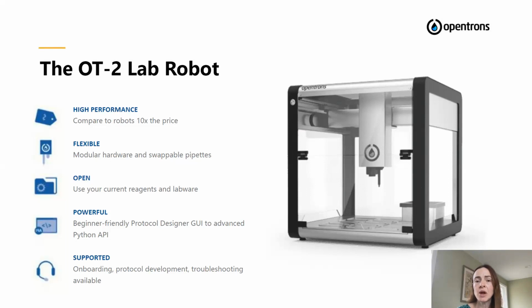One of the things that prevent people from getting into lab automation is the high upfront cost, and then also, as Carlos mentioned, the fear, right? So that's something that I think we're all very committed to, is really opening up the possibility of lab automation to a broader audience.